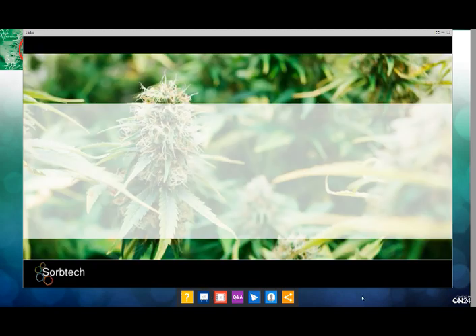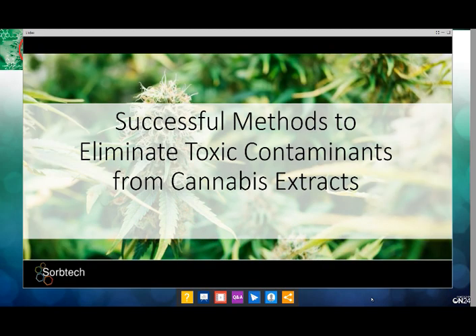Thanks, Meg, for that intro. Good morning, everyone. Welcome, and thank you for joining us today. Our webinar, Successful Methods to Eliminate Toxic Contaminants from Cannabis Extracts, presents ongoing research that was started in March by Sorbtech because of the challenge for us to properly direct our customers in the optimal use of stationary phases such as Florisil and silica gel, etc., for the difficult challenge to decontaminate cannabis extracts to meet state regulations.